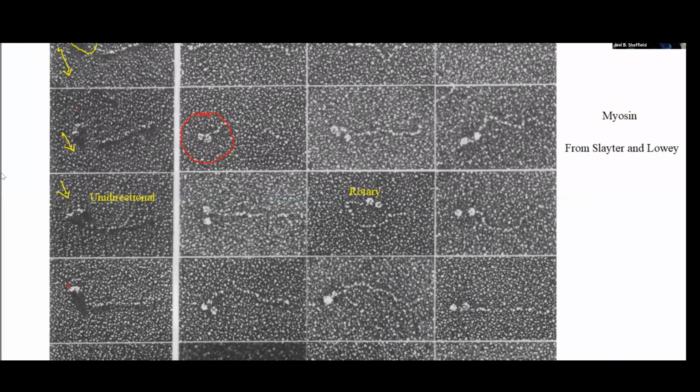And so you can play the game a little bit more by saying, let me change the angle at which I do the shadow. Remember, if this is my structure, and I've got a grid over here and a filament over here, and I'm shadowing it this direction. If my object is fairly big, then a shadow is okay. If the object is really tiny, I may not see much of the shadow. And the way to get the shadow is to move the filament way down so that you're shadowing at an angle of, say, 6 degrees rather than 20 degrees or more.